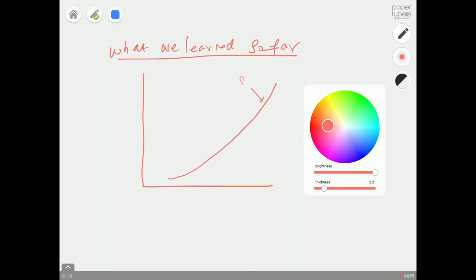So that's your solubility curve. I hope you all remember the experiment we did just now. So this is your 40 degrees centigrade, that's your saturation temperature. You must remember what a saturation temperature is, and this is your working temperature, say 20 degrees centigrade. In fact, for the laboratory experiment which I posted on YouTube, I performed the crystal growth experiment at 20 degrees centigrade. I created the solution using the solubility curve of paracetamol. So let's do that experiment now.